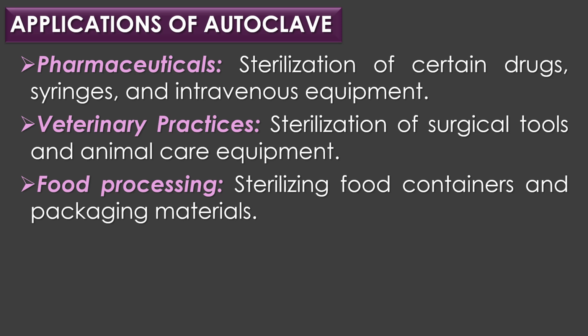In pharmaceuticals, autoclave is used for the sterilization of certain drugs, syringes, and intravenous equipment. In veterinary practices, autoclave is used for sterilization of surgical tools and animal care equipment. In food processing, autoclave is used for sterilizing food containers and packaging materials.